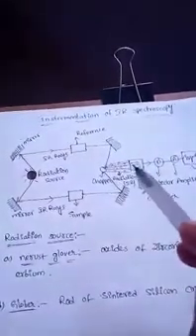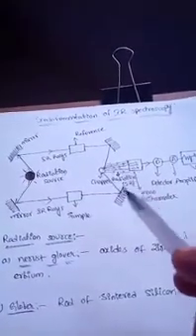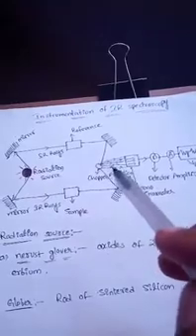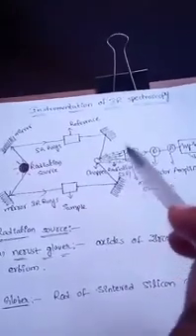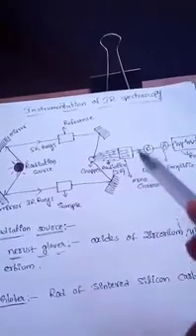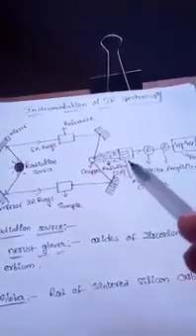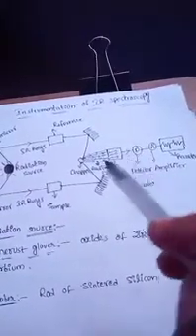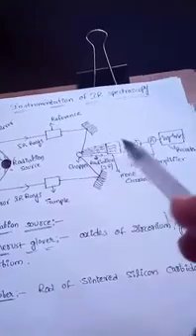The chopper produces IR radiation. This bulk range of IR radiation moves towards the monochromator. The monochromator separates the bulk radiation into monochromatic radiation; its purpose is that the bulk rays are converted into a single ray.